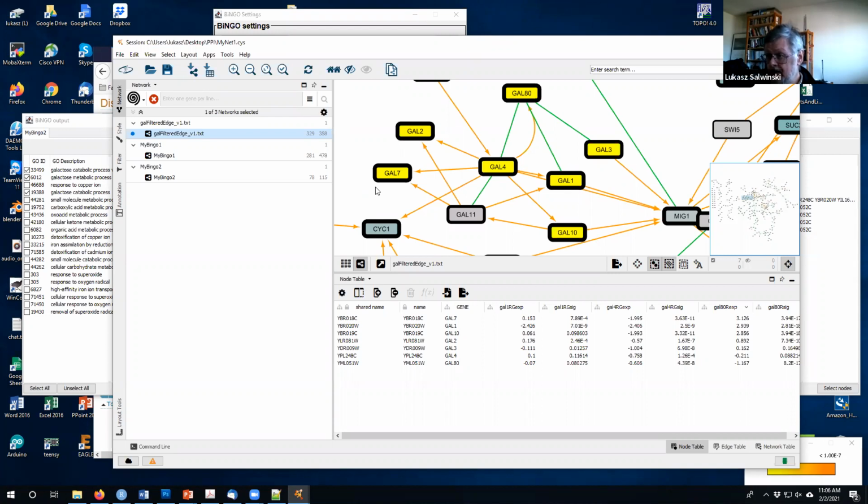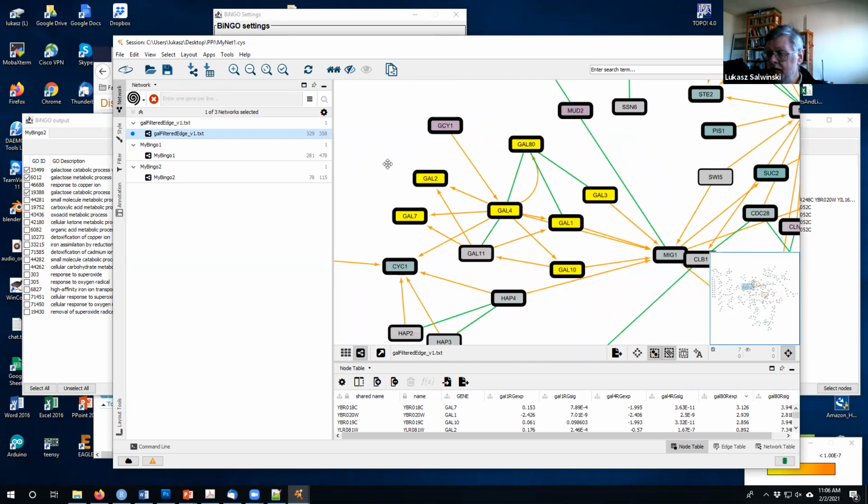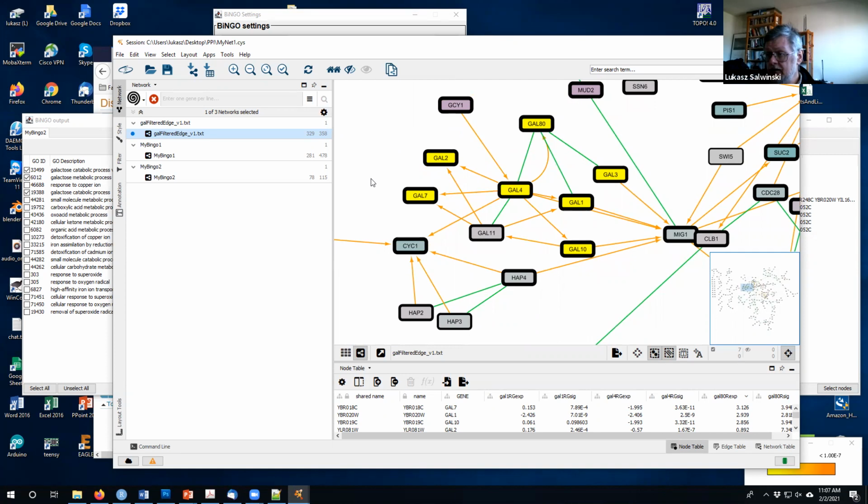You might also, as here, map those genes on an interaction network, and you might observe that they show up within the same region of a network. So this is another hint that this is a group of related genes that are doing some particular function working within one particular network. So that's one of the ways of analyzing protein function and trying to identify what different proteins do and how they work in a cell.